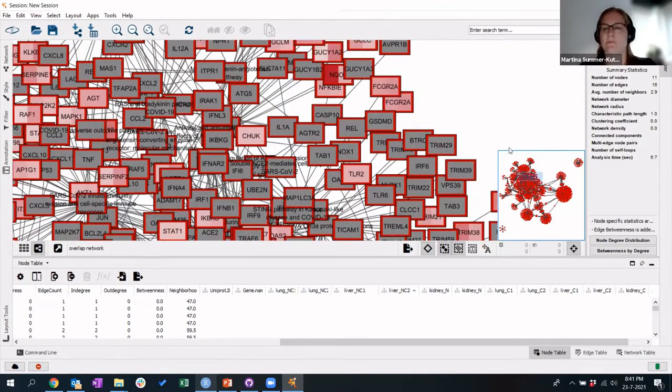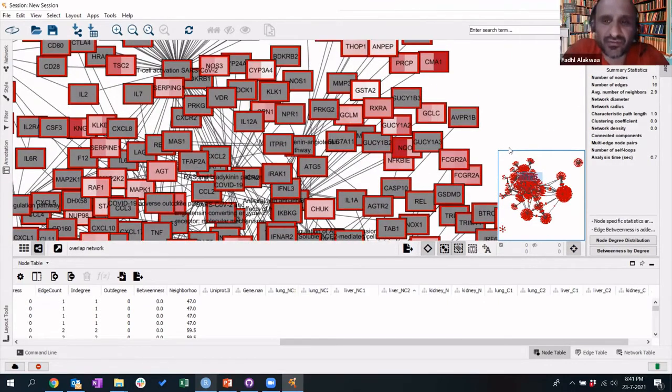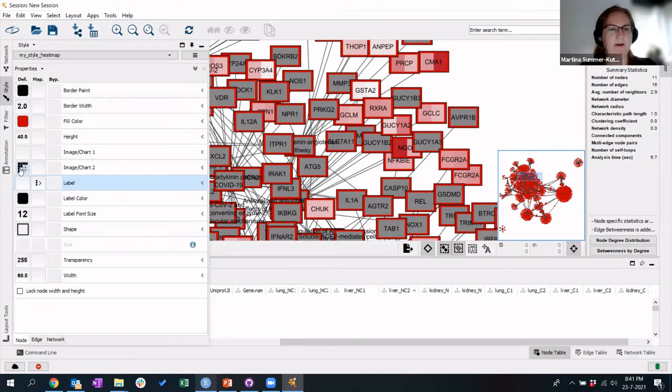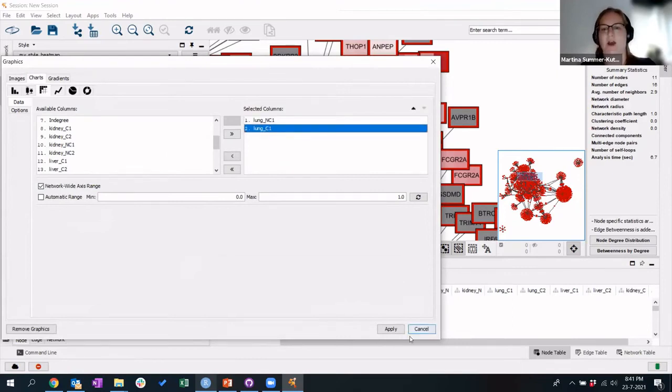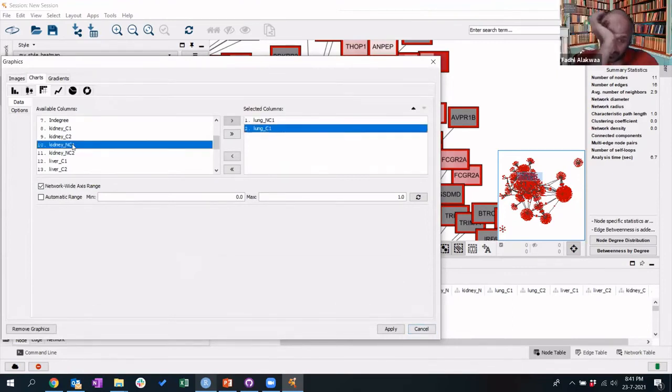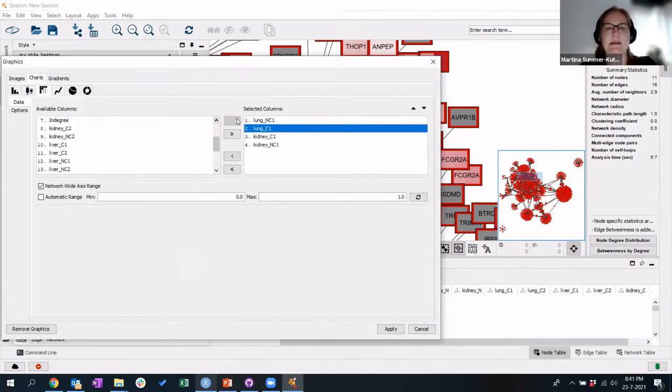Martina, I didn't get, how did you only change the level from 6 level to only 2 level? In here, I deselected the other tissues. So I only select lung now. Got you. Yeah, and I could, for example, say, okay, I only want to know kidney and kidney, for example, as an example, and I move those back.